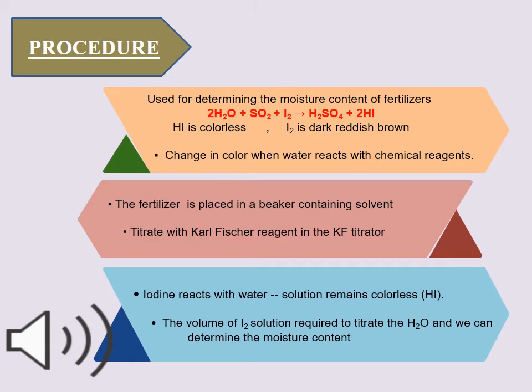Now the procedure of this process: we know that this KF titration is used because we determine the water content in the sample that is to be analyzed.